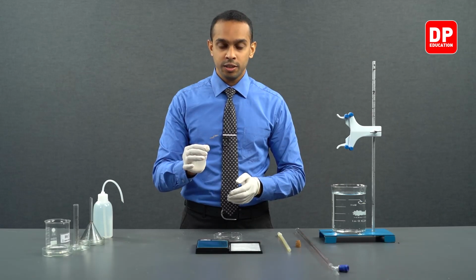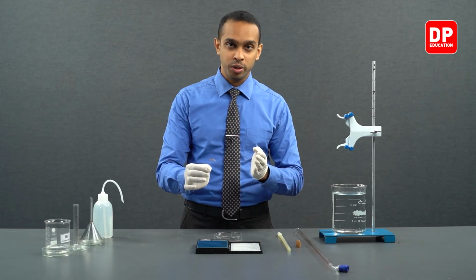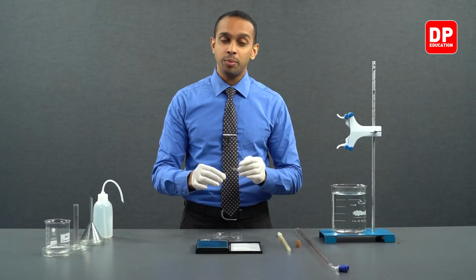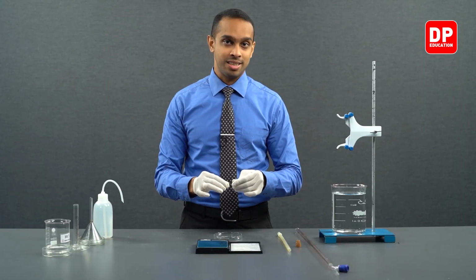After tying it to our copper wire, making sure that it is tightly held to the copper wire, we can move on to our next step.